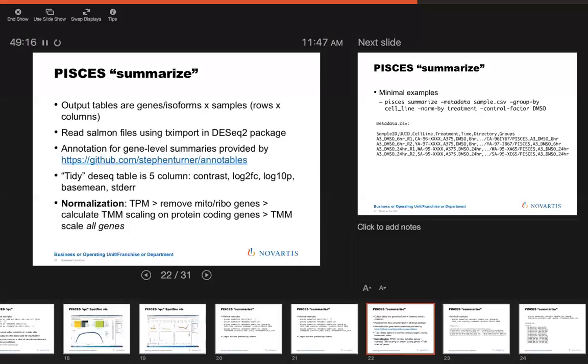One thing that I forgot to mention here. So you're worried about transcriptome mass, right? Yeah, you're worried that if you have huge contributions by non-coding genes and you exclude those from normalization factor calculations, that you'll be overestimating. What I forgot to mention is that to make this normalization scheme appropriate, I actually rescale the TPM data before I do any TMM normalization by taking all the protein coding genes, summing their values, and then scaling those all up to 1 million. So you start with TPM of just the protein coding subset of the transcriptome, and then you calculate scaling factors just on the protein coding genome.